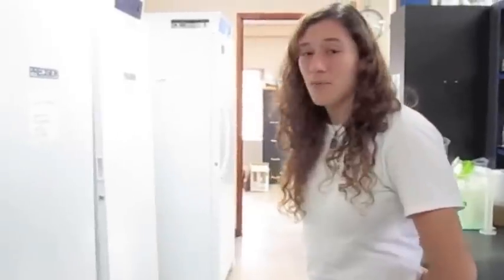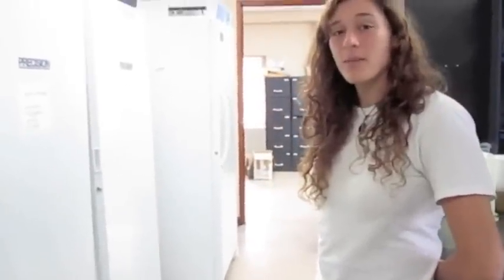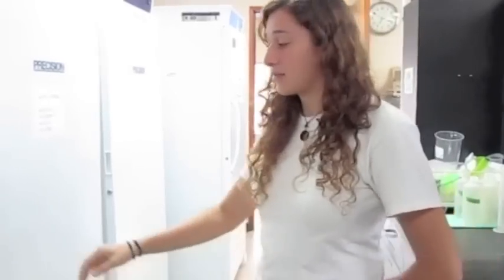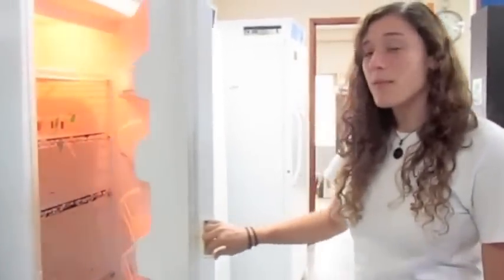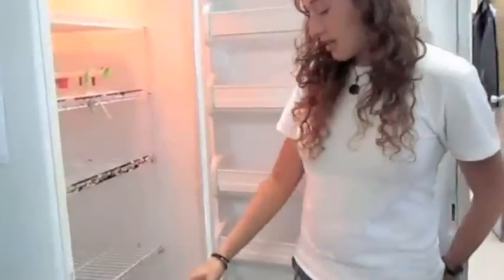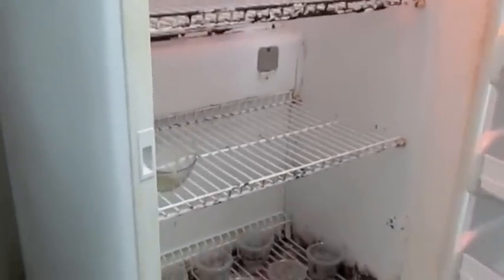In the lab here, I'm running a salinity tolerance experiment with my larvae. I'm trying to see what kind of salinities they can tolerate and survive through. I'm incubating capsules with embryos at 29 degrees Celsius in a range of different salinities from 0 parts per thousand to 40 parts per thousand.